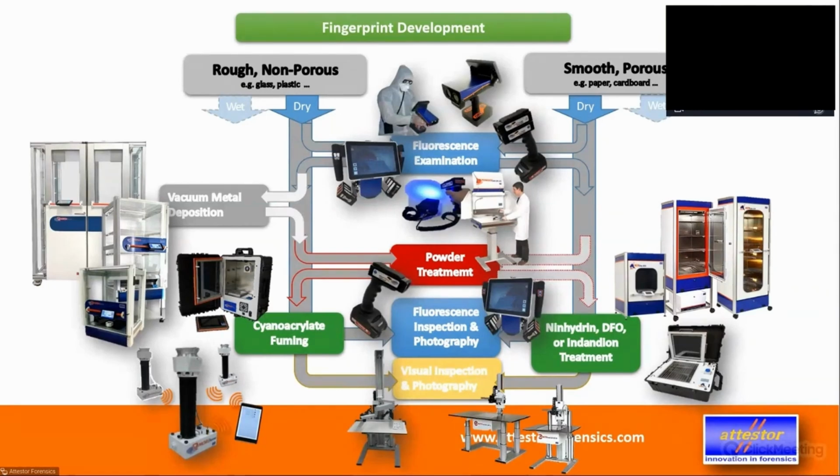And at the very bottom, you see a system that we call MEGAfume. That is for fuming fingerprints in a complete crime scene, like let's say an underground drug plant, which you find with heaps of plastic sheets, tubing, cables, whatever. You don't want to carry all of that into the laboratory. You just want to fume the complete room because that's afterwards scrapped anyway.